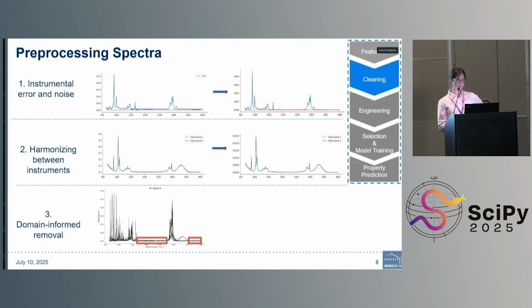And then we had to harmonize our data. Our dataset came from two different instruments, each with slightly different resolution and response profiles. So, for example, one sample might record a value at 650.142 and another at 650.147. And so to make them comparable, we binned the spectra into consistent wave number ranges and merged locally similar regions, and also normalized each spectrum by its sum to focus on relative shape rather than the actual absorbance values, which, as I've said, can really vary between instruments.